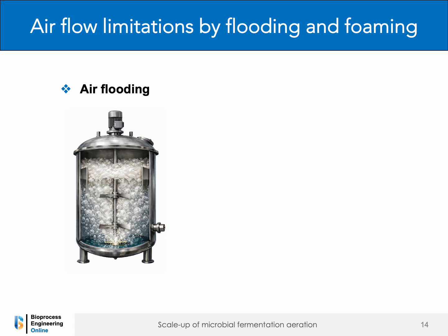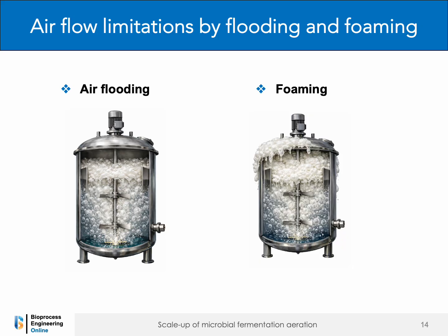Foaming occurs when gas bubbles rising through the fermentation broth do not readily collapse at the liquid surface, but are instead stabilized by surface-active compounds produced or released during the fermentation. This leads to the formation of a persistent foam layer in the headspace, which can cause operational difficulties and limit further increases in aeration rate.